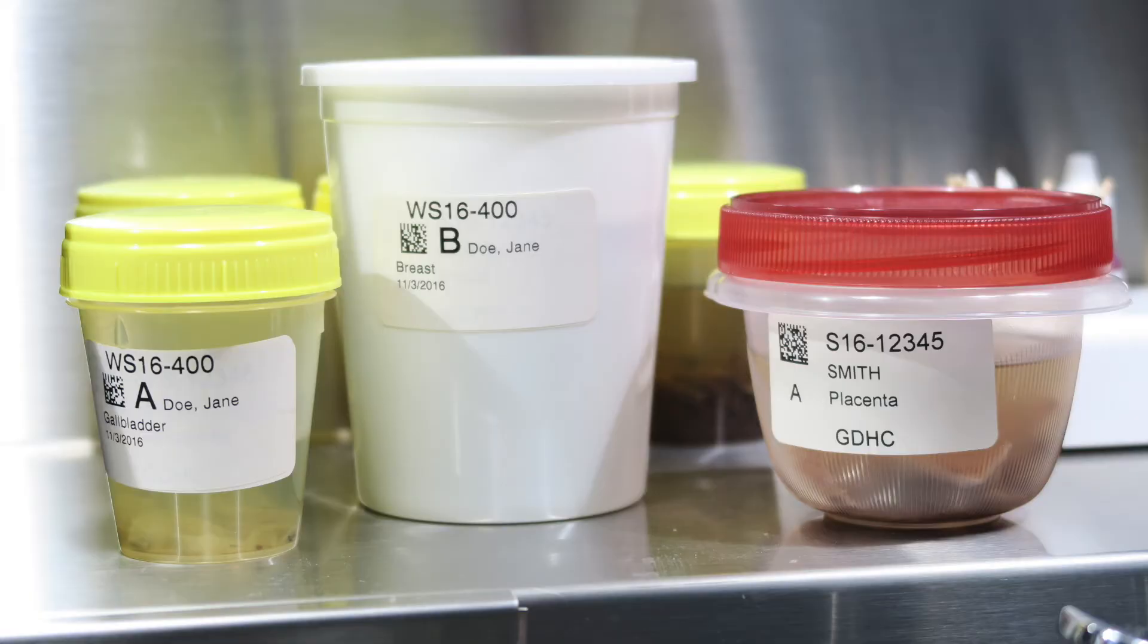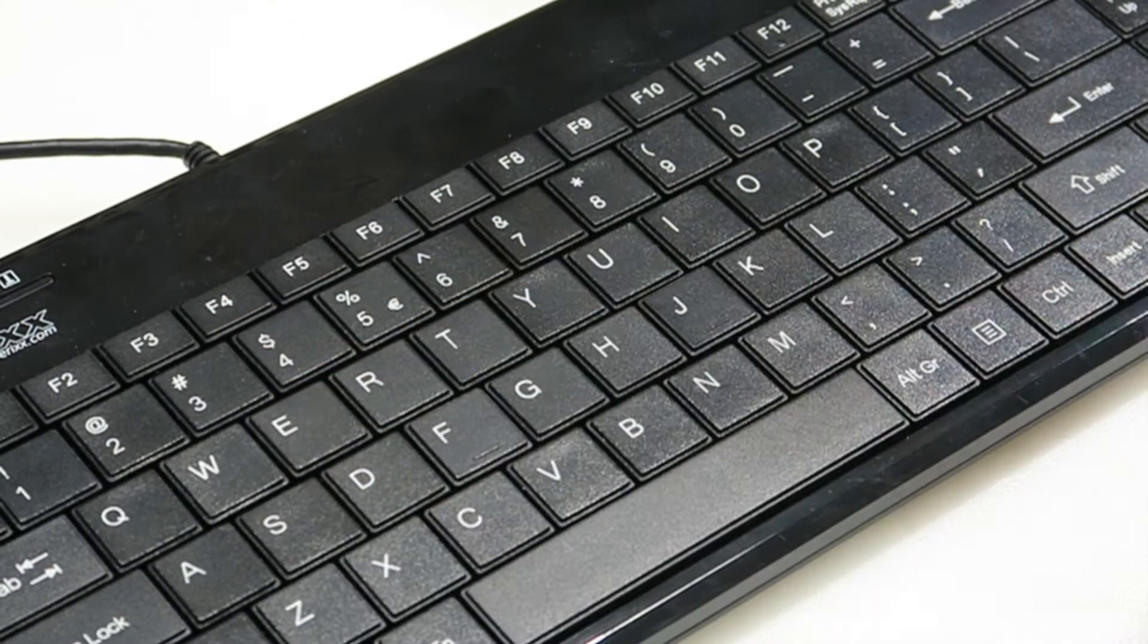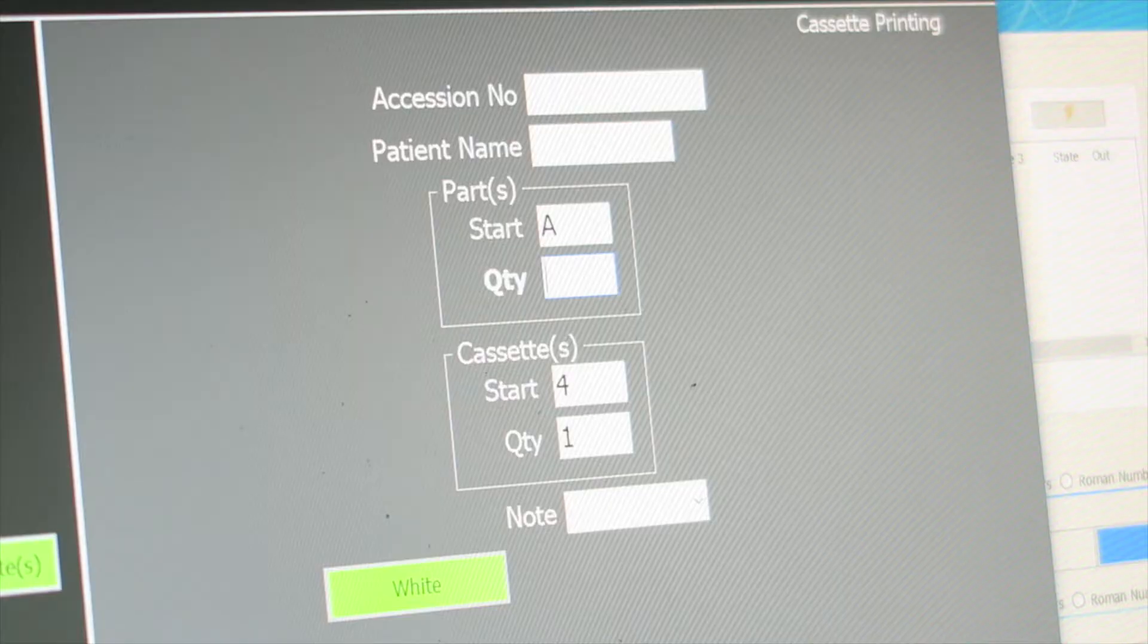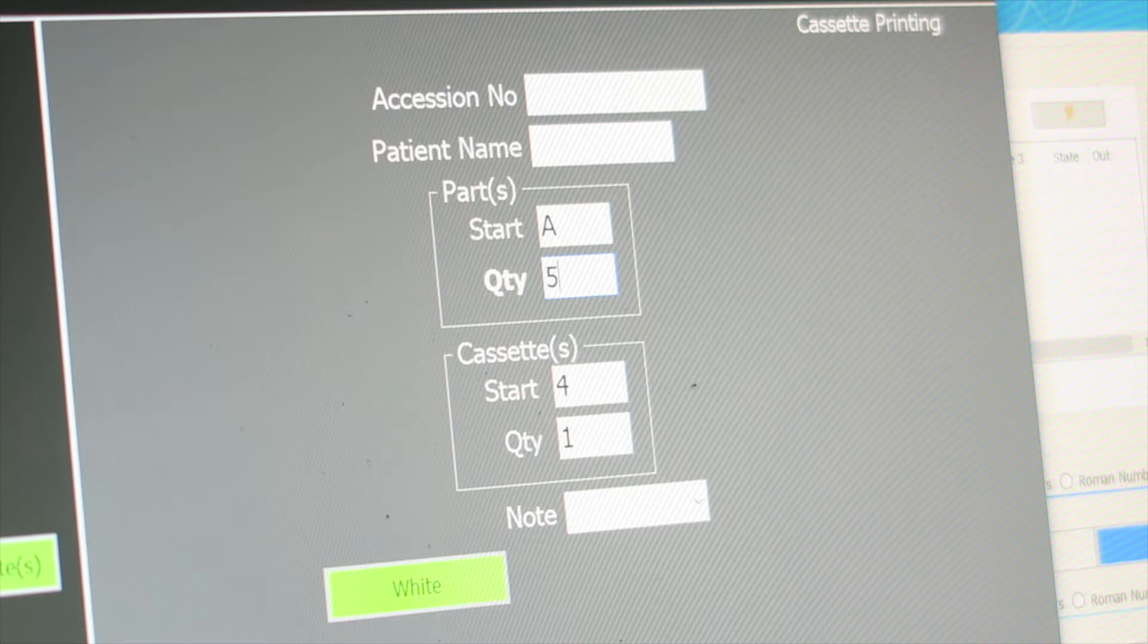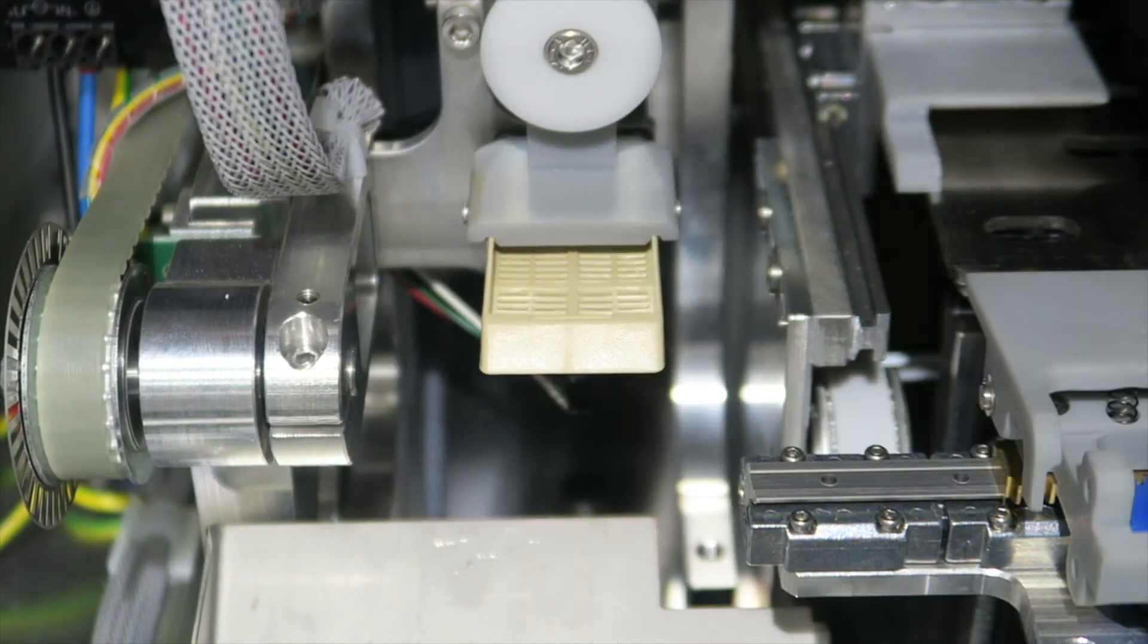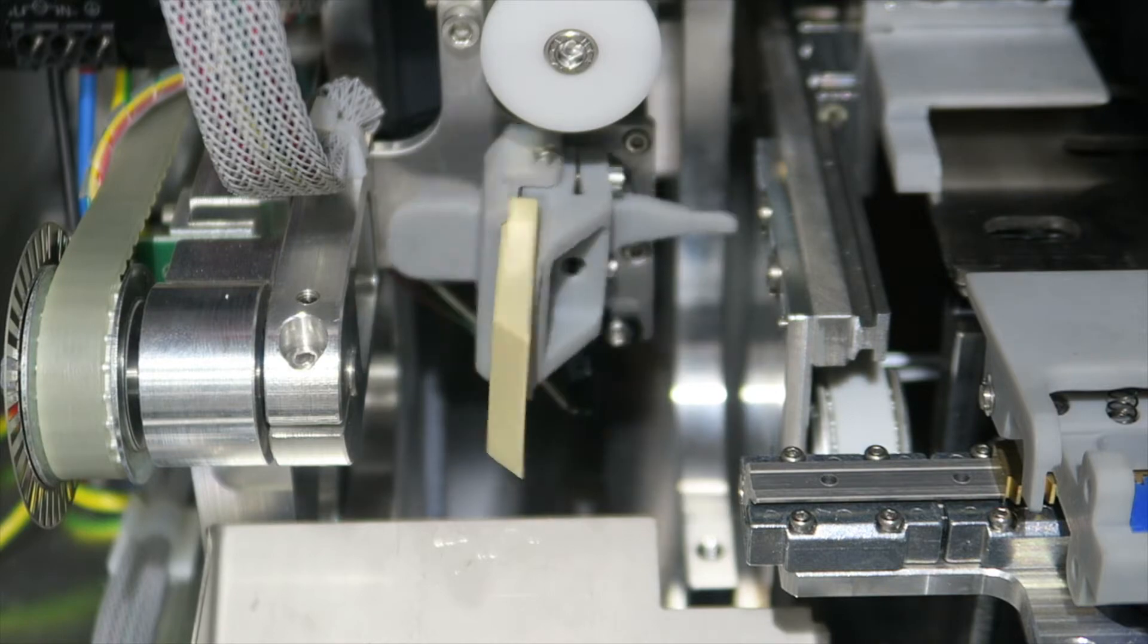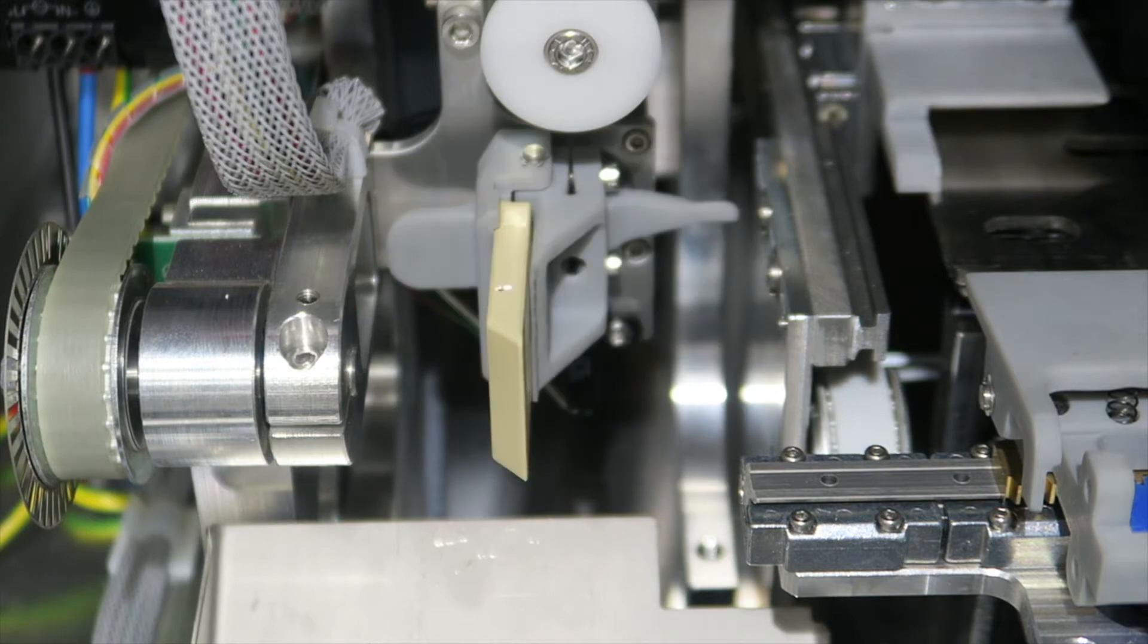Labs that use barcodes on cassettes to identify and track tissue specimens can significantly increase patient safety through positive patient identification. If labs want these barcodes to scan reliably to increase productivity, they must use laser printing technology.